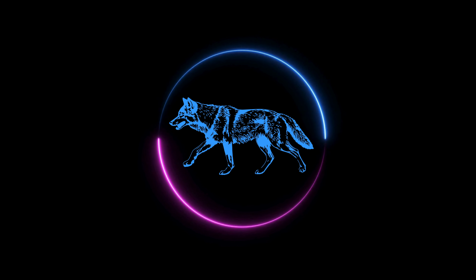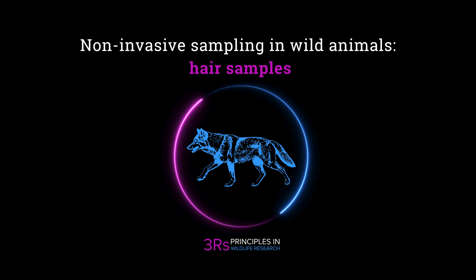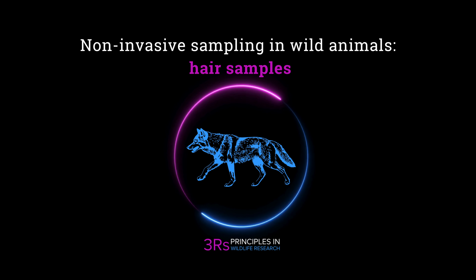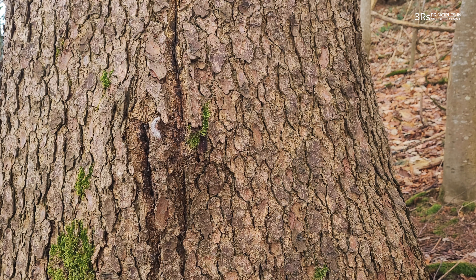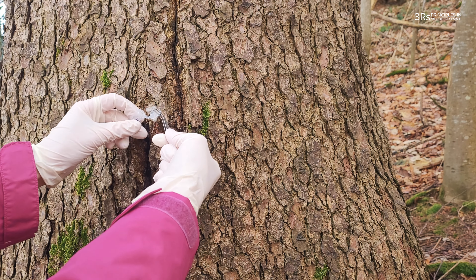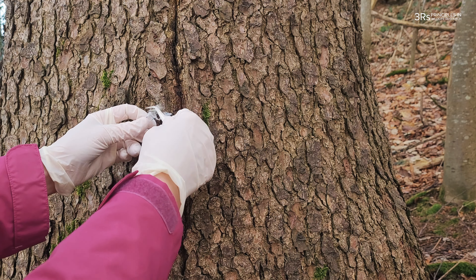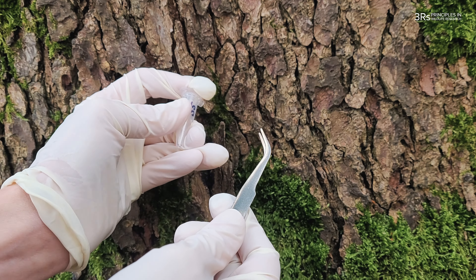Hello and welcome to this instructional video on non-invasive hair sampling in wild animals. In this video, we'll show you how to perform this technique. If you are conducting research during which you are observing animals in the field, it might be possible to obtain samples by collecting shed hair on trees that the animals had rubbed on, or on the ground where they had been resting.